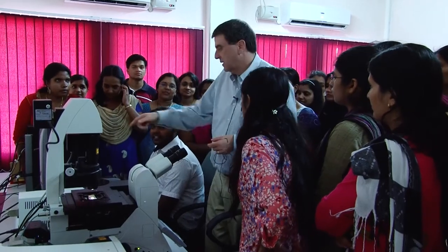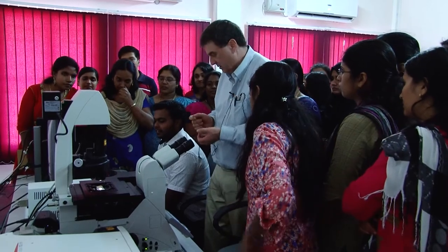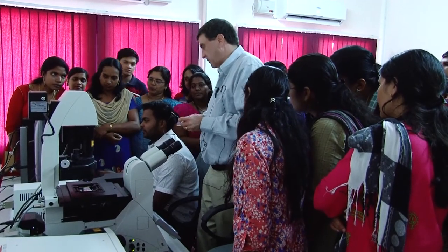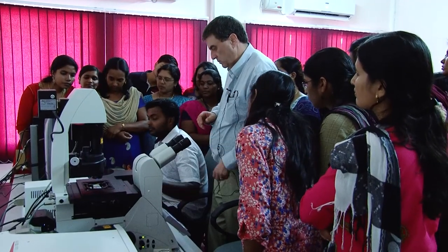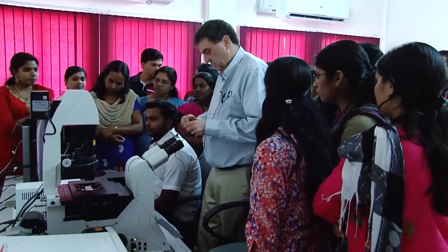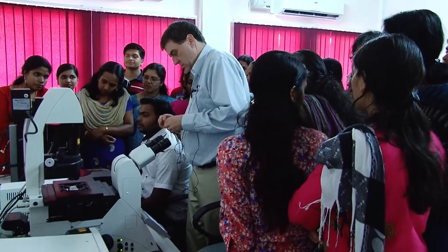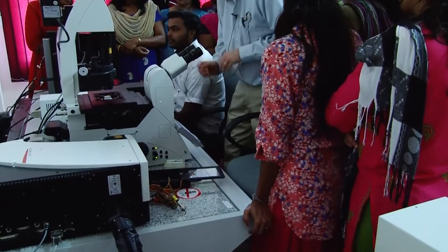Plankton, right? Okay, so let's send it over to the confocal and let's take a picture of what she's been looking at here. Now, the nice thing about this, it's a good demonstration because the diatoms tend to autofluoresce. So we're not really using a fluorescent dye. Now the problem is different ones fluoresce differently. So you're running the scan right now? Yeah, it's a live image.